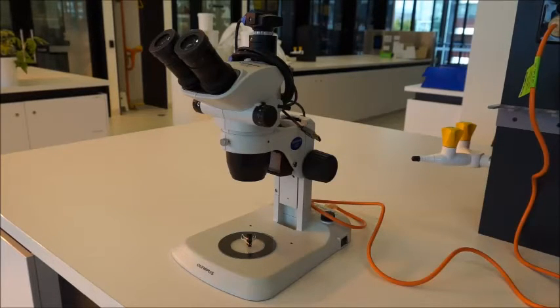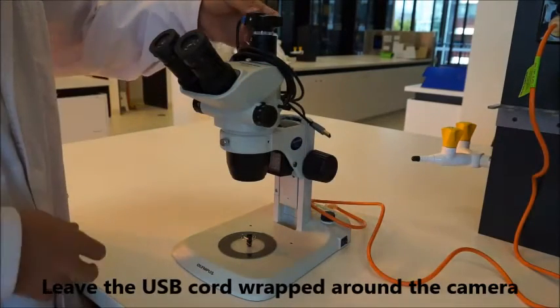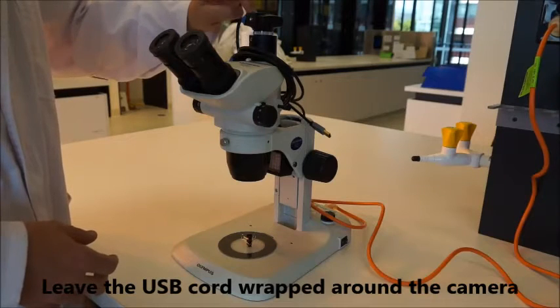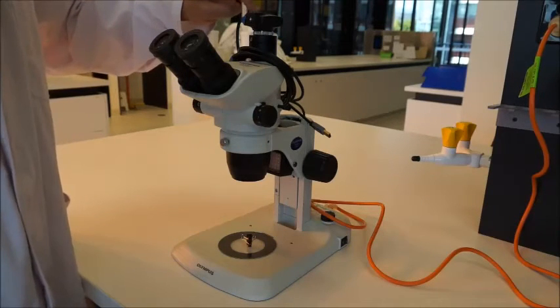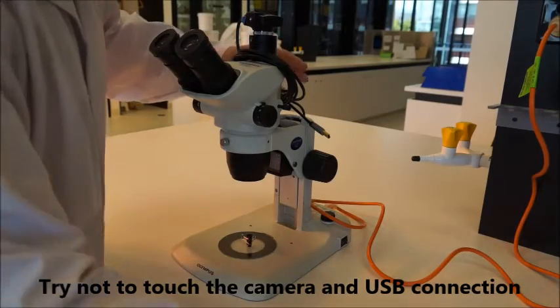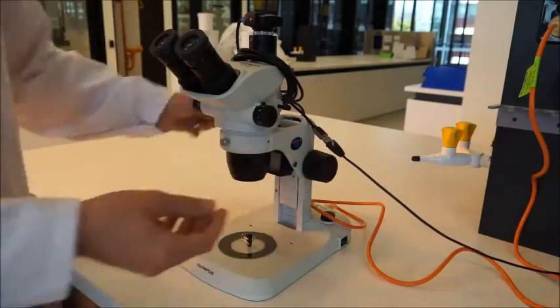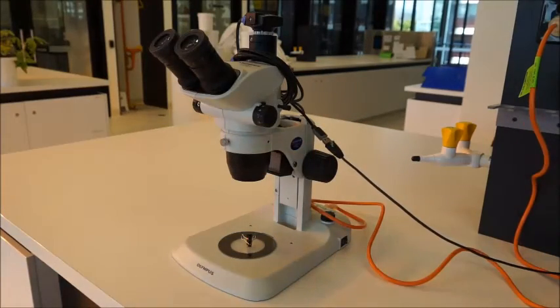The power cord plugs into the power source obviously. The USB cord from the camera — you can see there's blue tape around the camera cord. This cord is quite delicate and we've found in the past this is where the cameras are breaking. So leave the USB cables there and just attach to the USB cable coming out the back of the computer. Leave that cable in place because the cameras are quite expensive and hard to fix.